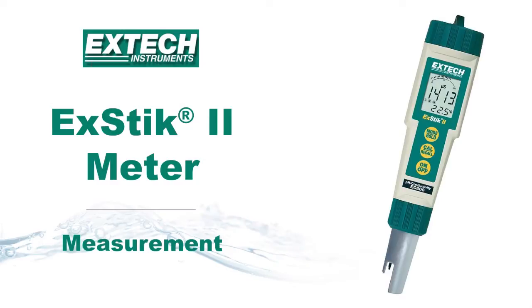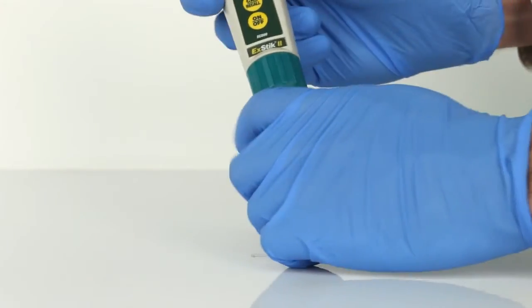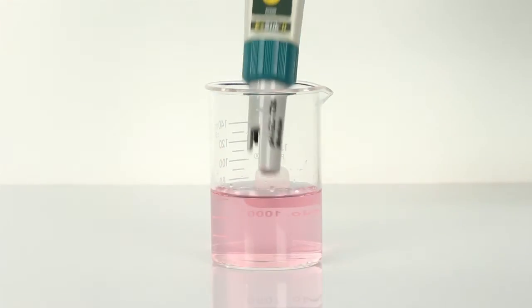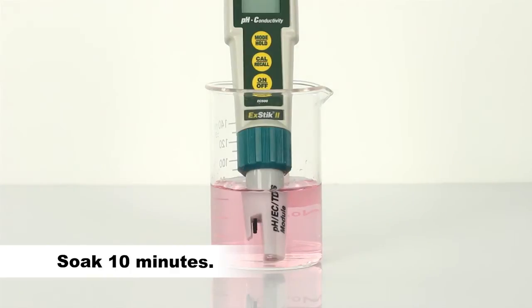This is a demonstration on how to take a measurement using the X-TIC 2 meter from X-TEC instruments. Remove the cap from the bottom of the X-TIC to expose the electrodes. Before the first use or after storage, soak the electrode in pH 4 buffer solution for about 10 minutes.